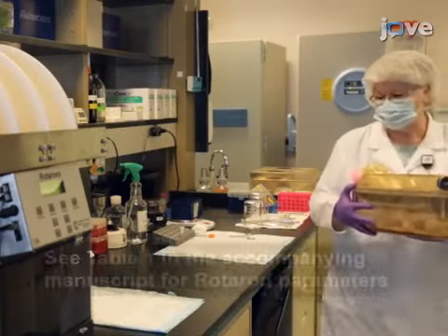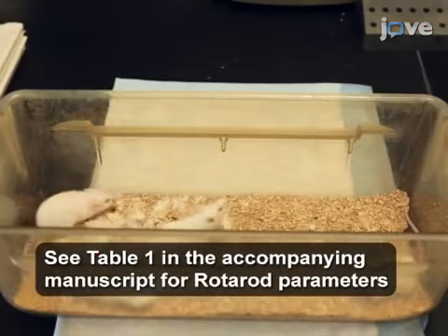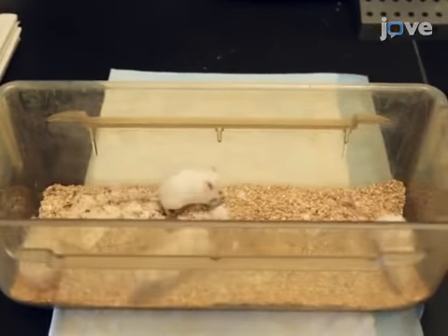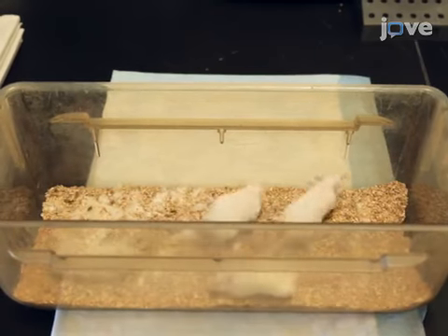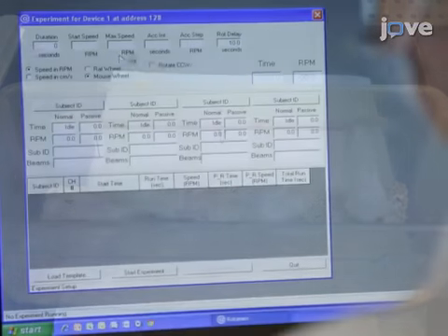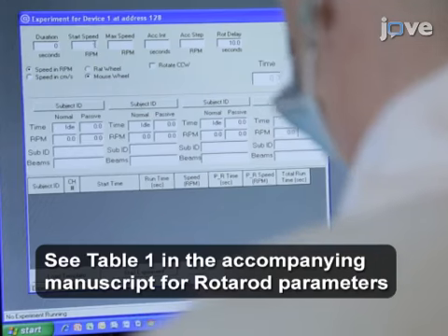In order to assess baseline balance, coordination and motor control, start the adaptation protocol 5 days prior to TMEV infection by first allowing the mice to acclimate to the testing room for at least 30 minutes. While the mice are acclimating, preset the Rotarod with the -5 DPI training parameters.